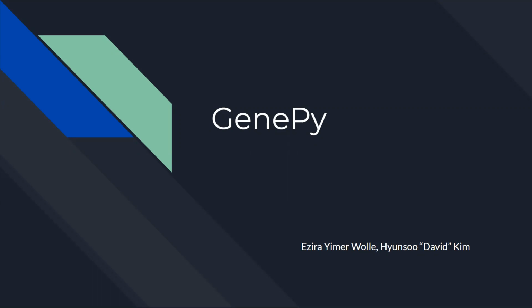My partner is David. In this video, we'll go over a brief introduction to GenePy and then go over some demonstrations on using GenePy and some examples.